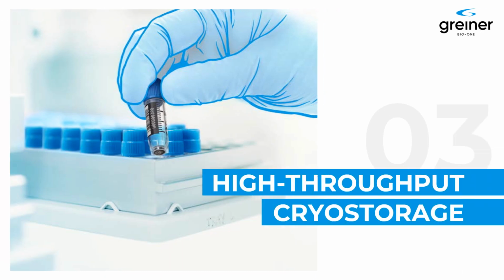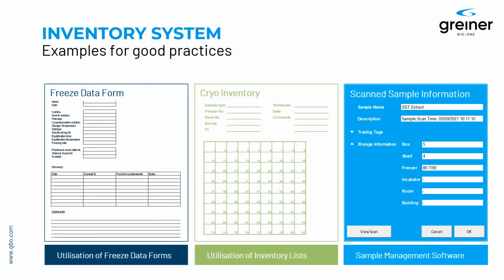In the last part of my presentation, I want to finally talk about high-throughput cryostorage, modern options for tracking and automation of cryopreservation tasks. On this slide, I want to give you several basic examples of good practices with regard to freezing, documentation, and also tracking samples.